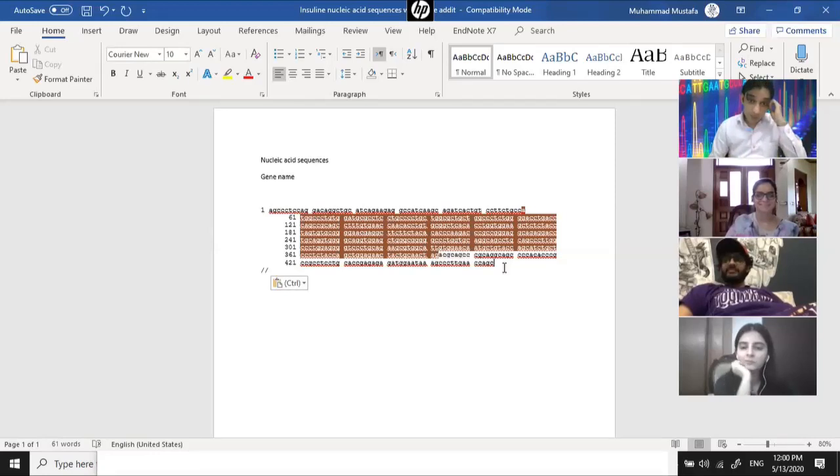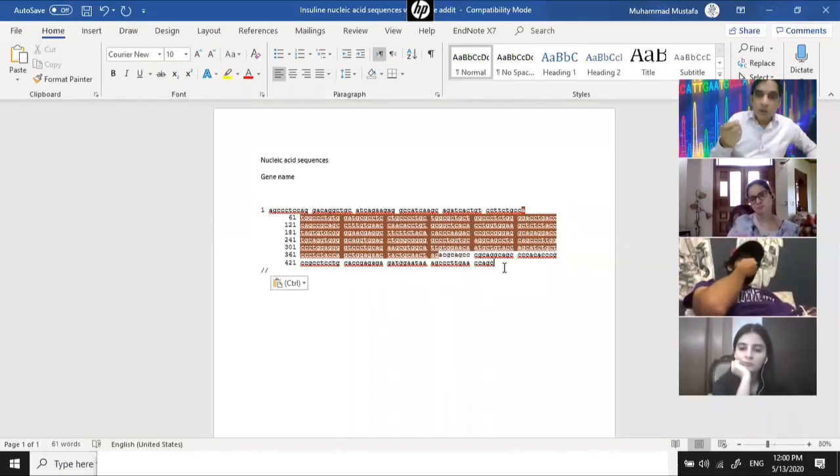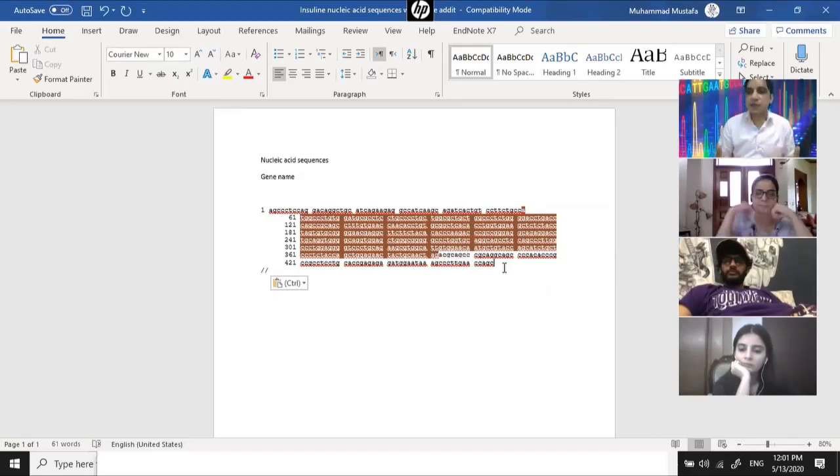So Microsoft Word and the text file are word processors. They think whatever you are putting in, these are words, alphabets, words, paragraphs. They think about numbers in a different way. You think about A, C, T, G as alphabets. They have no idea these are DNA sequences.